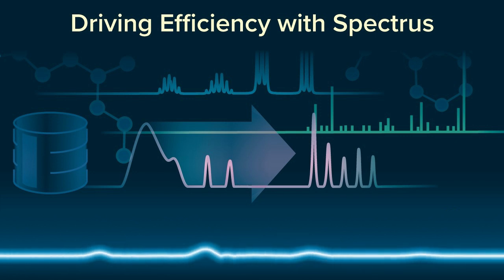It's able to interface with existing systems that we have at GSK, such as our materials inventory, which is really important to be able to track our starting materials. And it also allows for automatic data transfer and processing with our chosen analysis method. To start with, we have our chemists identifying a problem that they would like to solve with HTE. This could either be reaction optimization or just synthesizing multiple compounds all at the same time. They would then define the variables that they would like to test.